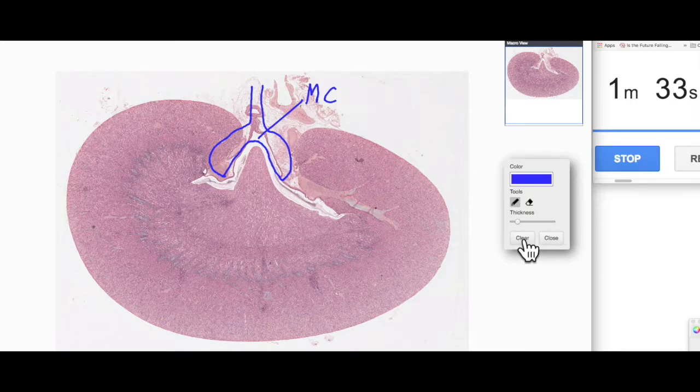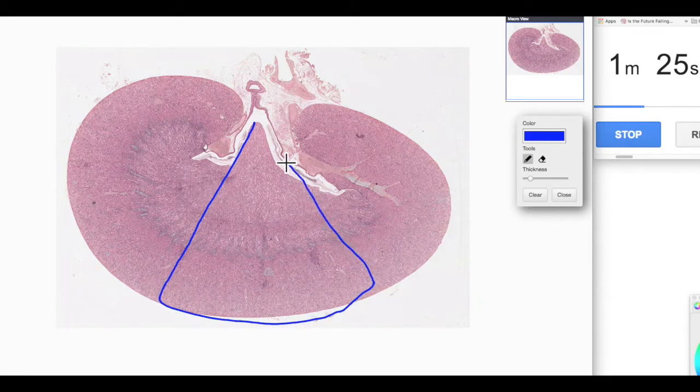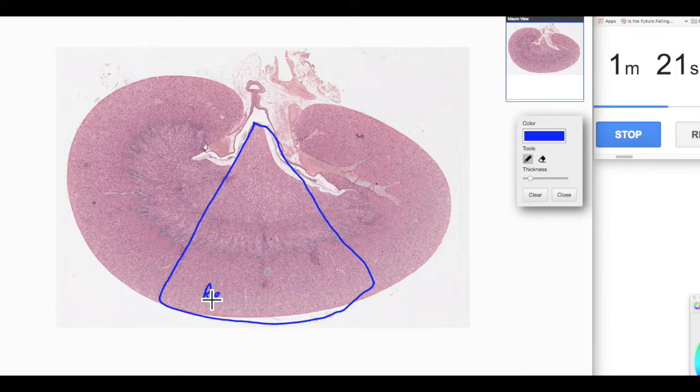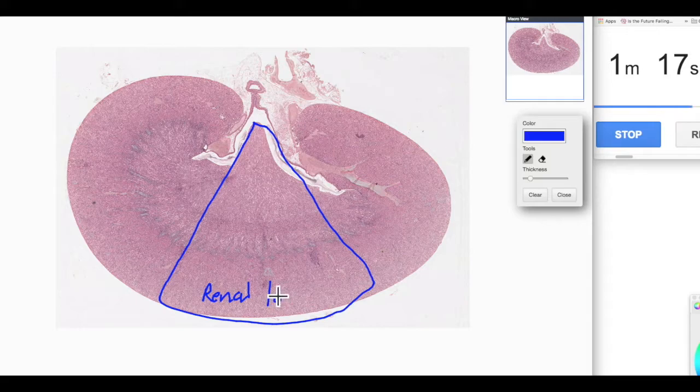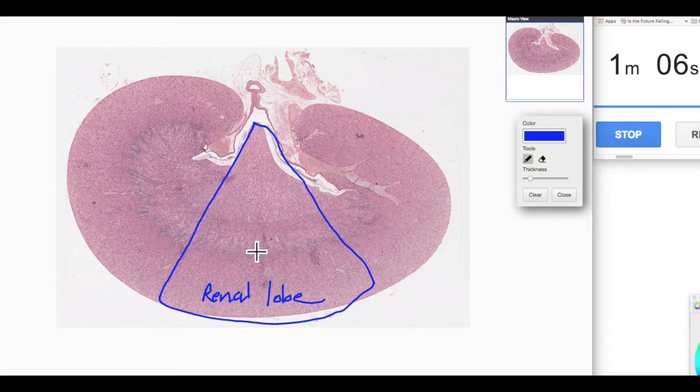So what is a lobe of the kidney? A renal lobe consists of a renal pyramid and its overlying cap of cortical tissue. Here's our renal lobe. Bear with me, I'm writing using the mouse. Renal lobe. Right. So there's our renal lobe: renal pyramid and its overlying cap of cortical tissue. Now in the rat and mouse, there's only one renal lobe. You can see it extends down around the outside. In humans, we have around 8 to 14 lobes.